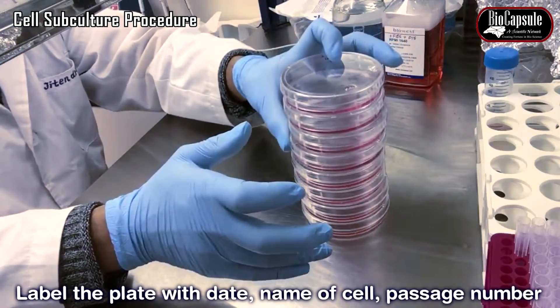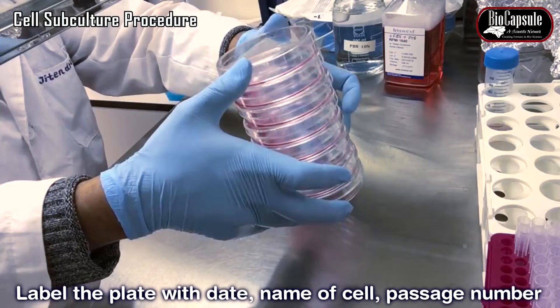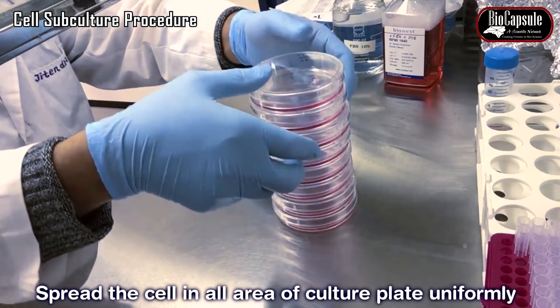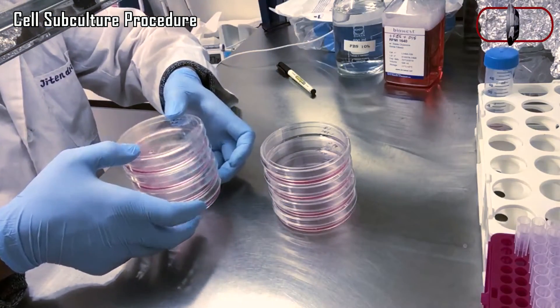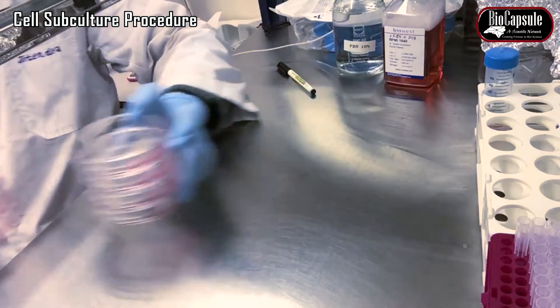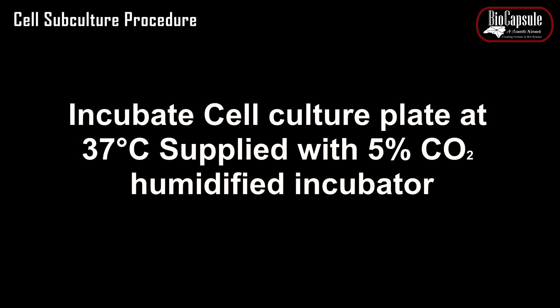Label the culture plate with the date, name of the cell, passage number, and name of the researcher. Then incubate the cells in a humidified incubator at 37 degrees centigrade supplied with 5% carbon dioxide.